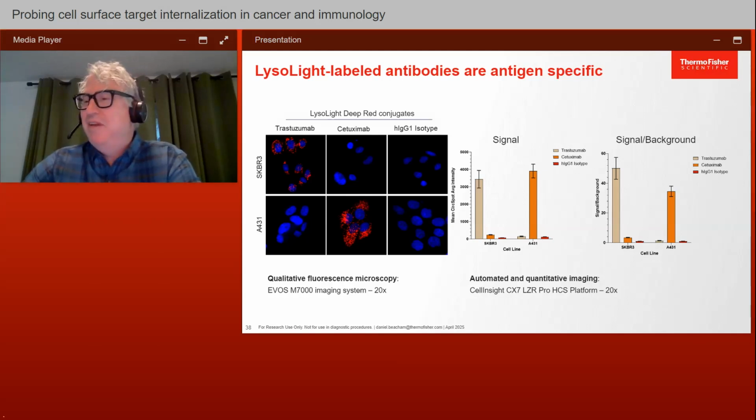People love to, sorry, just extemporize a bit here, but yeah, people love to stand on their bright signal. But in my view, the background is the most important of these measurements. Signal is a self-fulfilling prophecy in imaging, and so having a clean background and specificity stands above all. And so we go to the trouble to show that a few times whenever we put a new tool like this out here.